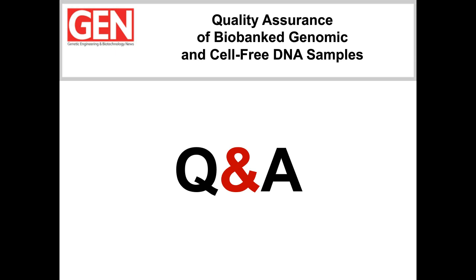So there are requirements for the biospecimens and also requirements for the quality control of the associated data. There are also several requirements concerning documentation on the testing, so the quality control assays that the laboratories are expected to perform for their resources. And there is also some information, just as information, so this is not mandatory, in the sense of not normative, it is informative, on the different quality control assays, again, that can be performed.